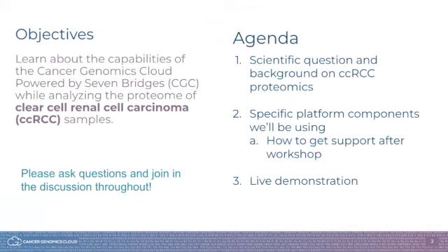So first, I'll present to you some context for the data we'll be using, and then go over the platform-specific components we'll use for the analysis. Finally, I'll do a live demo and show you just how easy it is to run a project using CGC. As always, feel free to ask questions throughout the presentation. Myself or Zelia will try our best to answer them. You can type them out in the chat, and we will be happy to reach out to you.